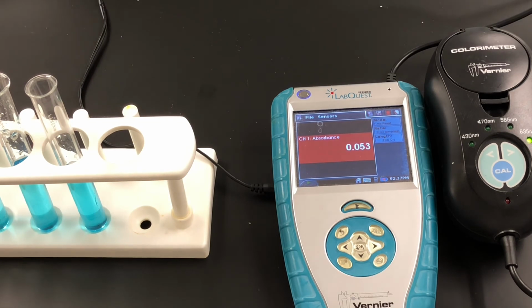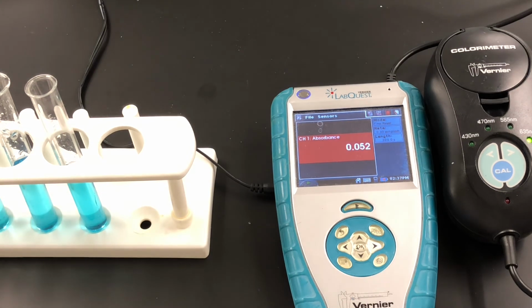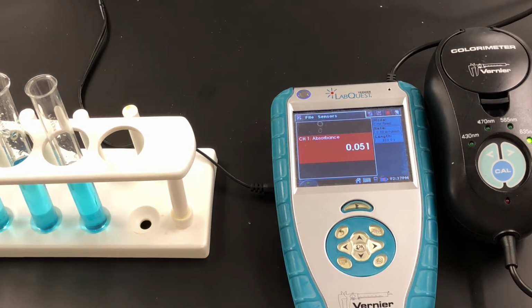So let's get the unknown rocking here. Lid on here.